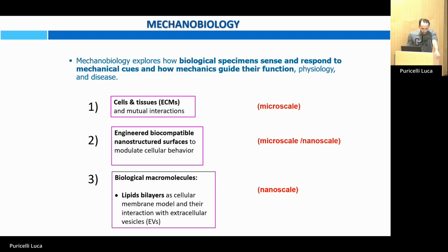For mechanobiology, we mean to measure how biological specimens sense and respond to mechanical stimuli from the external environment or from external objects, like the probe of a microscope, and how these mechanics influence their overall patho-physiological state.